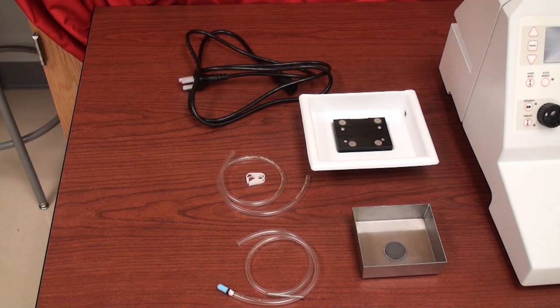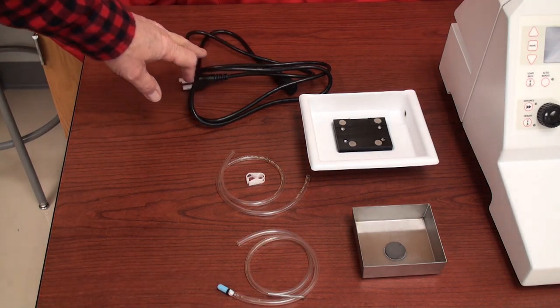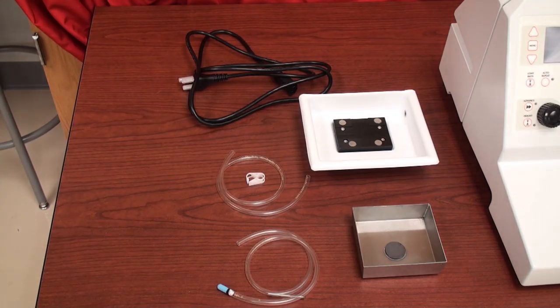First let's have a look at the items that are on the left-hand side of the main unit. We have a power cord for your local receptacle in the United States. The system runs on 115 volts 60 Hertz. There is a port on the back of the instrument which allows you to set to your local voltage — I'll show you that in a moment.